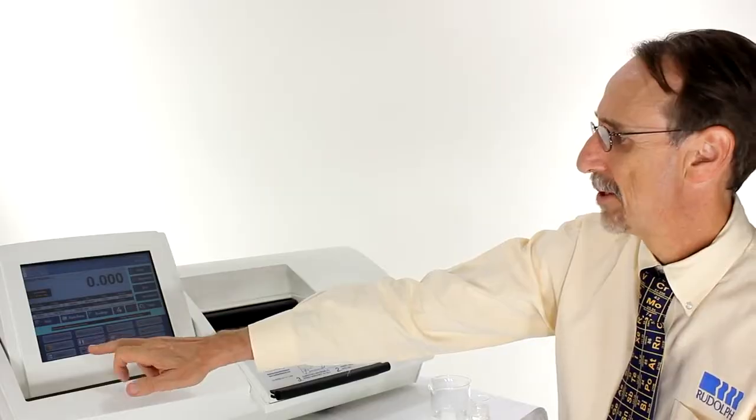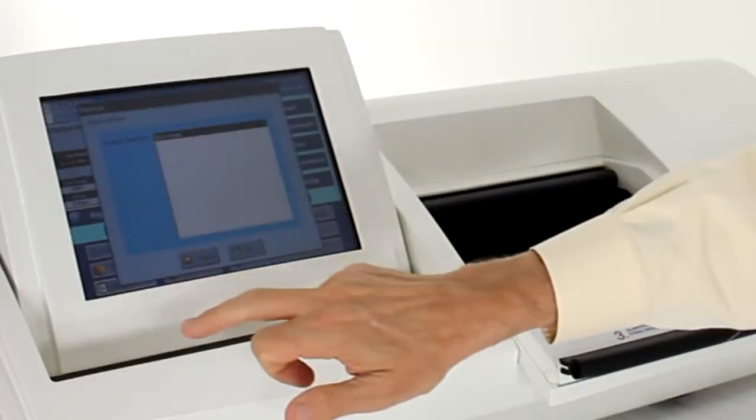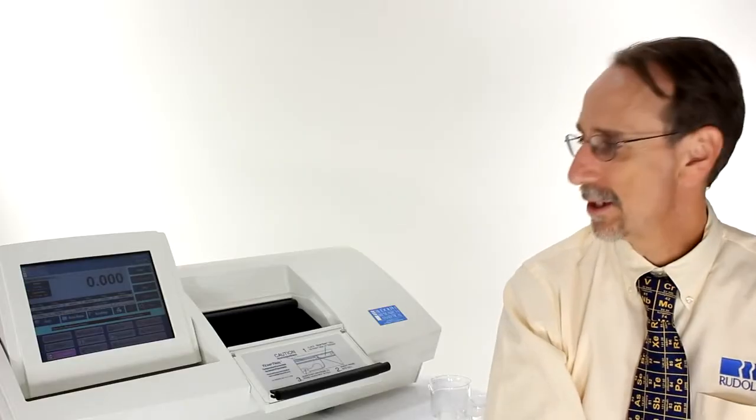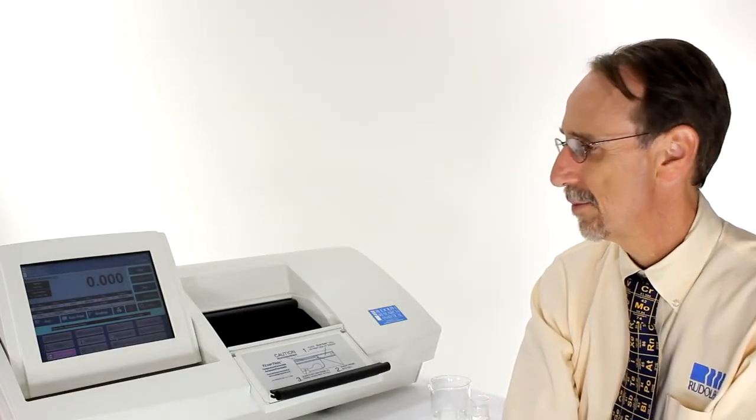With the Polarimeter the first step is to select the method. Press methods, select the method, press set. In this case I'm measuring sucrose so I've selected the sucrose method.